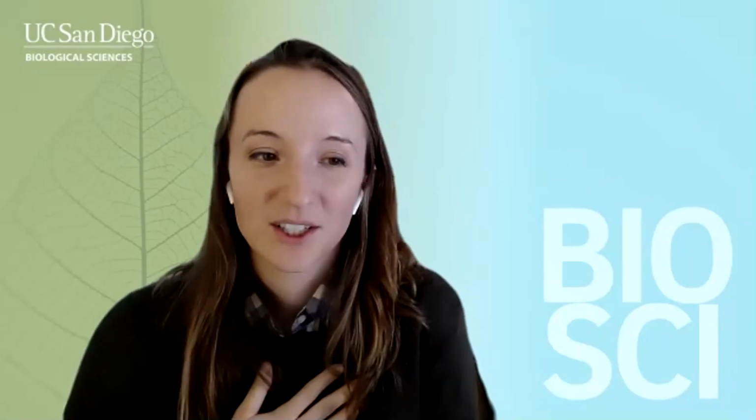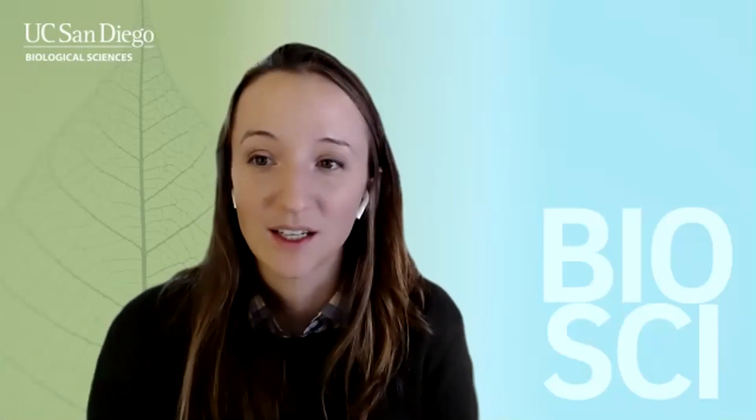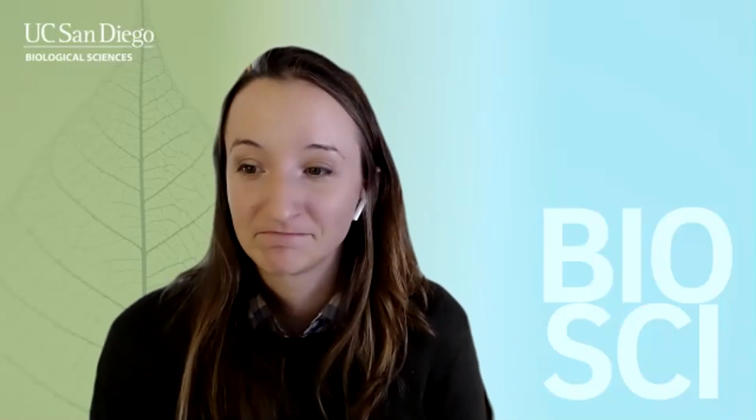Yeah, I think it's a great question. For me, what I would do is maybe start, if you have all your data in an Excel spreadsheet or something like that, that's a great place to start. Those are really easy to import into Pandas and Python for analysis. So that's a great place to start.